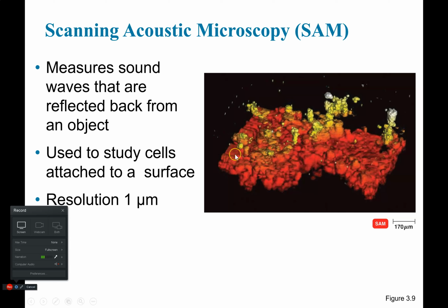And that's what we're actually seeing here in this picture. So this is not paramecium. This is looking at a biofilm.